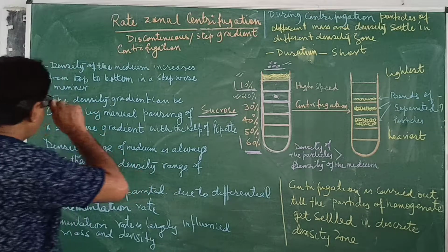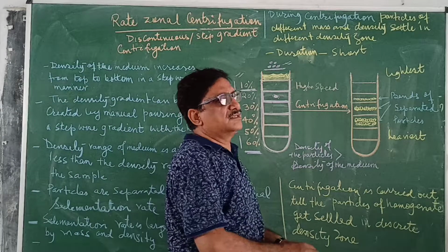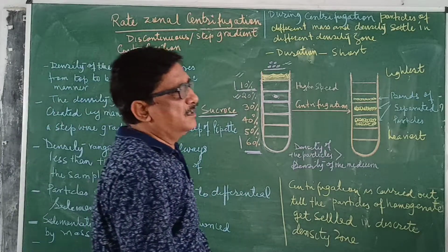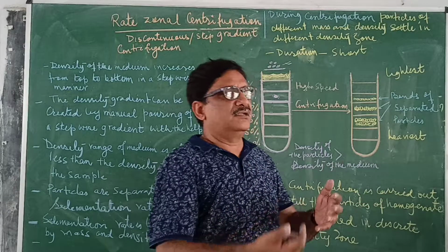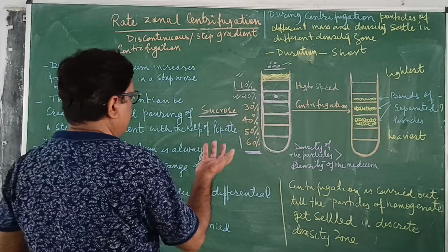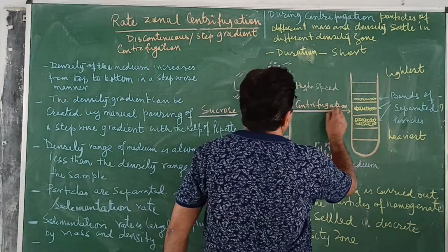In the continuous gradient, the gradient is created in industry or laboratory by machine.